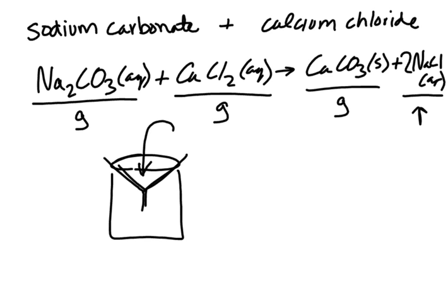All of the water, which has sodium chloride in it, since sodium chloride is aqueous, is going to drip down, leaving only the solid calcium carbonate stuck inside the filter. Then you'll let the filter dry overnight, and you'll get the mass the next day.